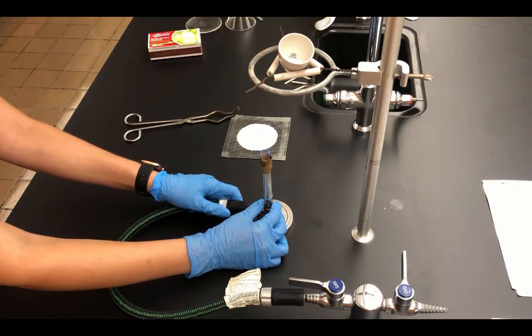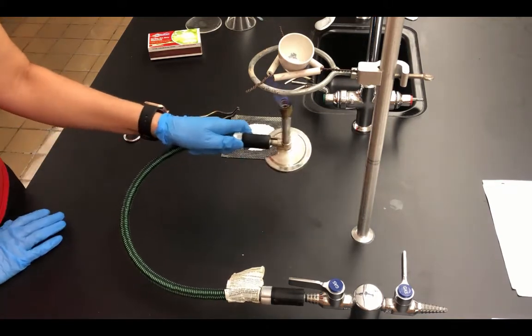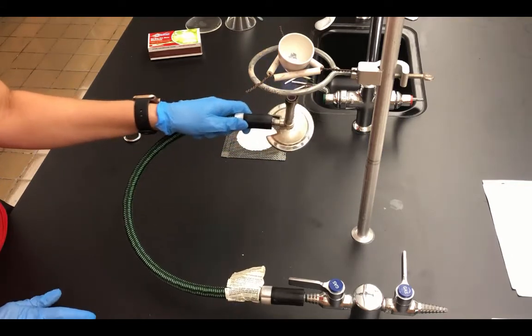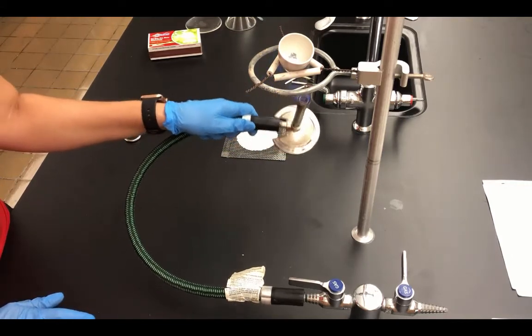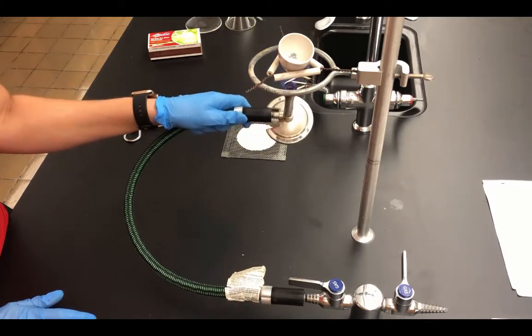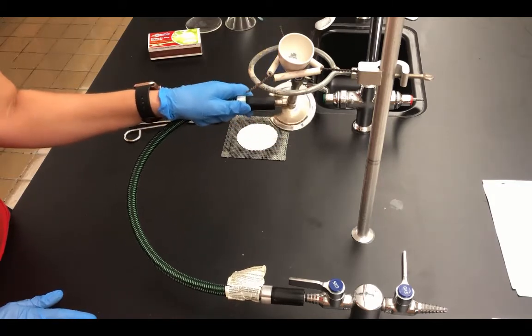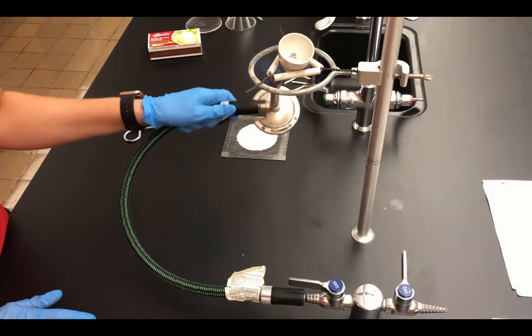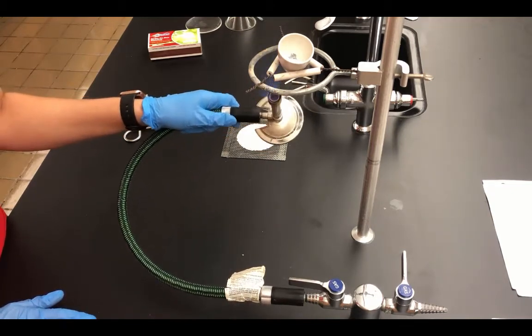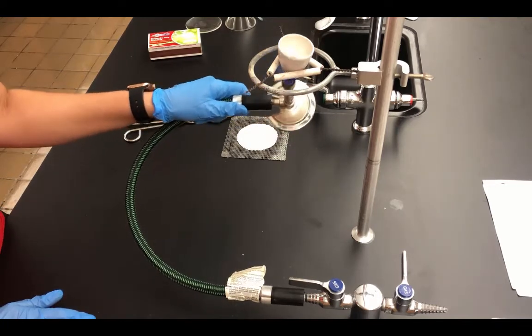I'm going to adjust the oxygen so that I get this nice cone, and I'm going to heat for the third time. Again, I'm going to be fanning the flame, brushing it back and forth for just a couple minutes, just to ensure that any water is gone. And once I'm done heating, I am going to let it cool to the touch again, and then I'll find the mass once more, and hopefully it doesn't change anymore.